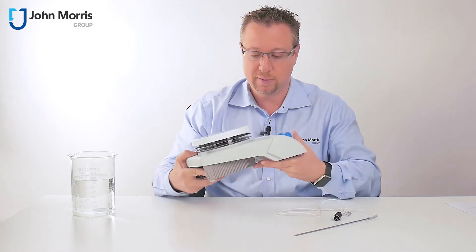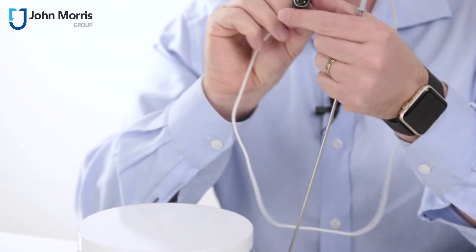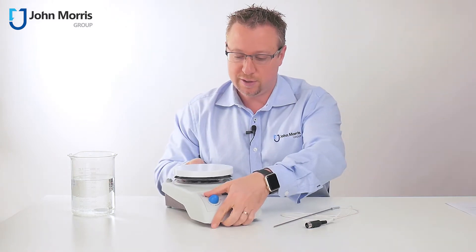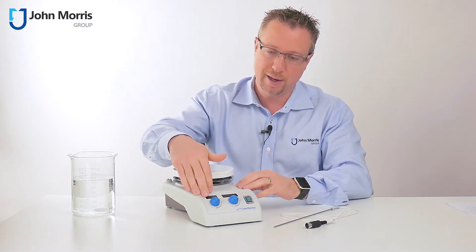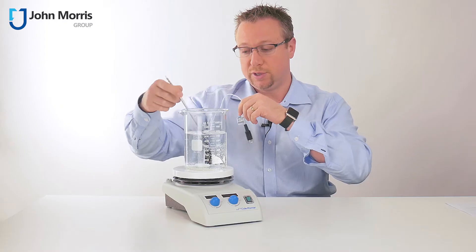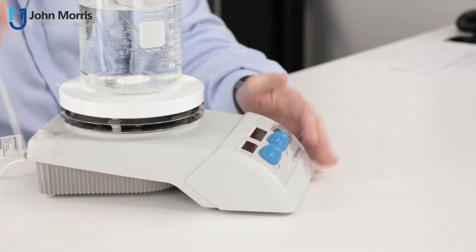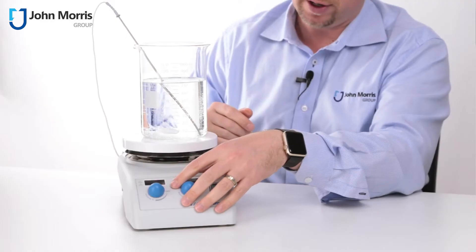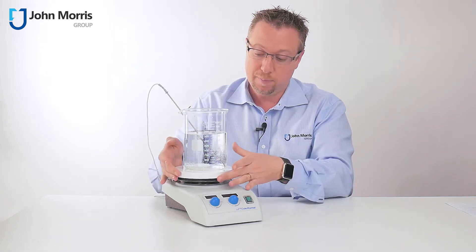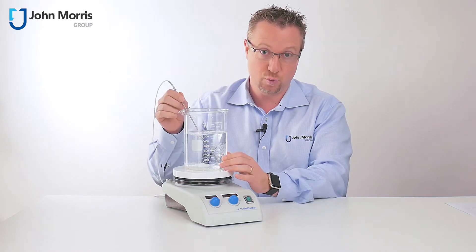There are a couple of other things I really like here. You have the option for an external PT100 sensor, and this is included in the package. You really want this because what it allows you to do is set the temperature of your hotplate magnetic stirrer by the temperature of your sample. The sensor plugs in at the back, and now the temperature that your hotplate magnetic stirrer is reading is the temperature of the sample, not the temperature of the hotplate. There's definitely a temperature gradient between the hotplate and the sample, so if you care about the temperature of your sample, this is a really handy feature.